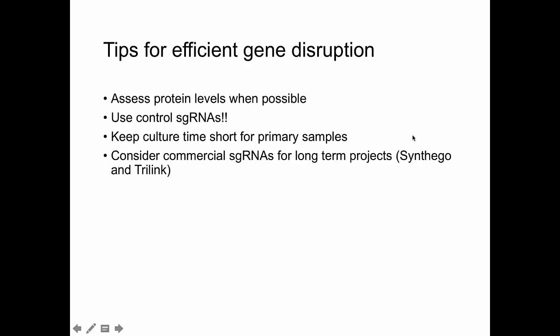We've had a couple instances where we use guides like CD40, or our guide for CD45, for a number of projects. We're using it as a control for all our experiments. And in those cases, it's really useful to actually buy from both Synthego and TriLink, the same two companies you mentioned, because they do have a lower toxicity compared to your IVT-produced guides. And in general, you can actually ramp up your scale now with Synthego to much higher yields. You can use it for 1,000 or so experiments.